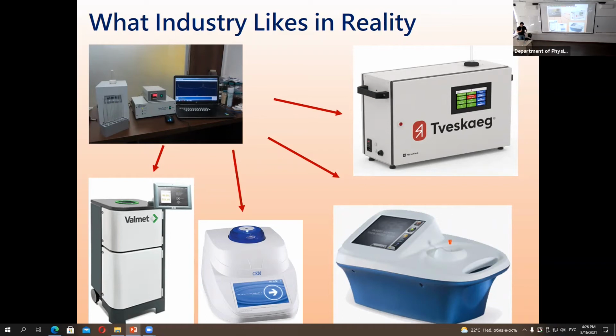Okay, then for the reception it is clear, but how about the opposite direction? If the coil transmits, you said you apply quite strong voltages. How does it affect the outside equipment and some other devices? Well, let me tell you about this instrument. You put the sample in this direction. The magnet generates the field in this direction, and you have the spiral coil.